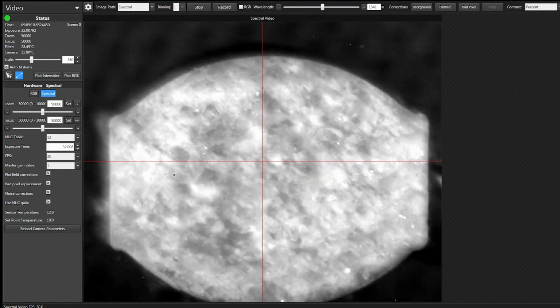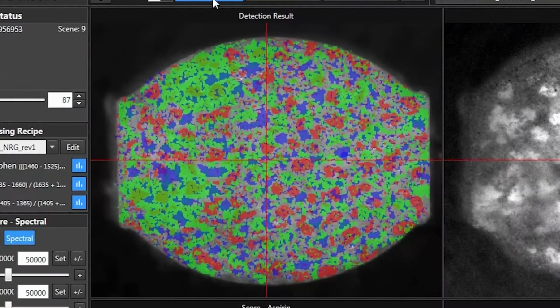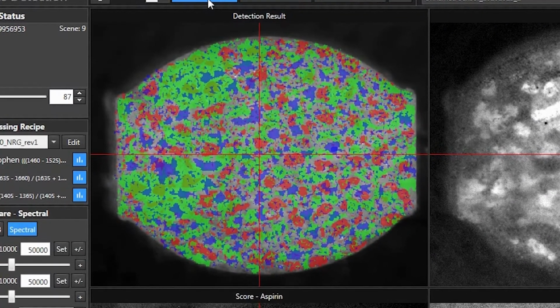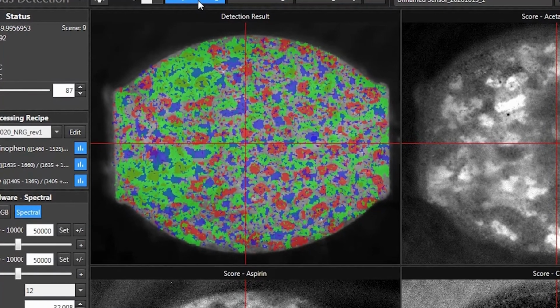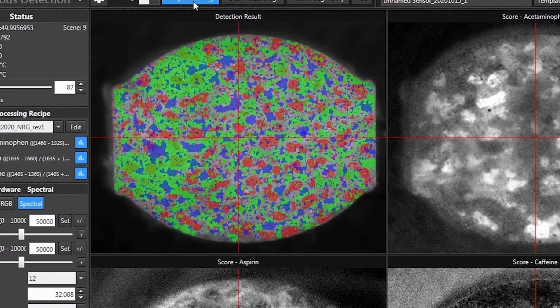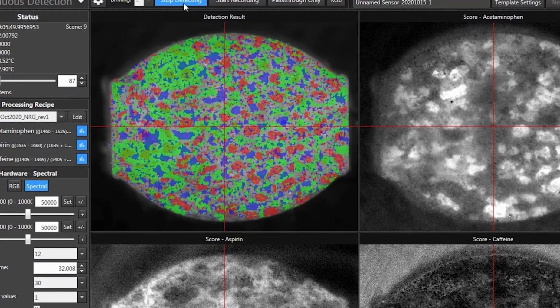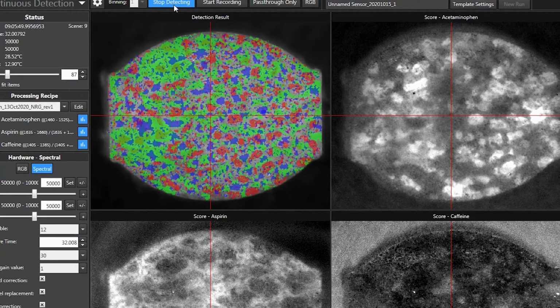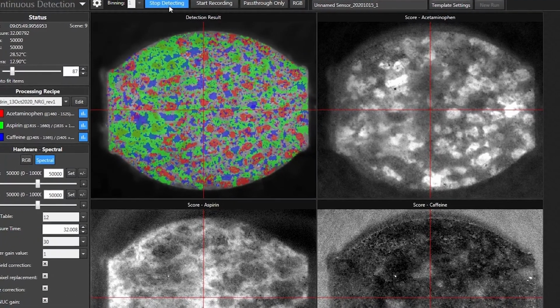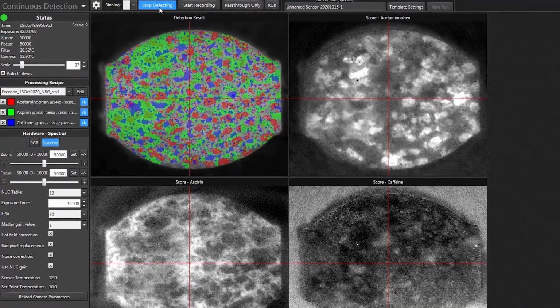With all of the identifying information now acquired and saved, we can make use of this new intelligence to identify the ingredients in an actual Excedrin tablet. The infrared image displayed is an Excedrin tablet cleaved along its short axis, exposing its interior. Applying the recipe results in the following false color image, showing the 3 active ingredients of the tablet, their particle sizing, and relative distribution. Areas of the image having no colorization indicate a lower correlation with the pure active ingredients and may be suggestive of active ingredient mixtures, excipient materials, and/or impurities.